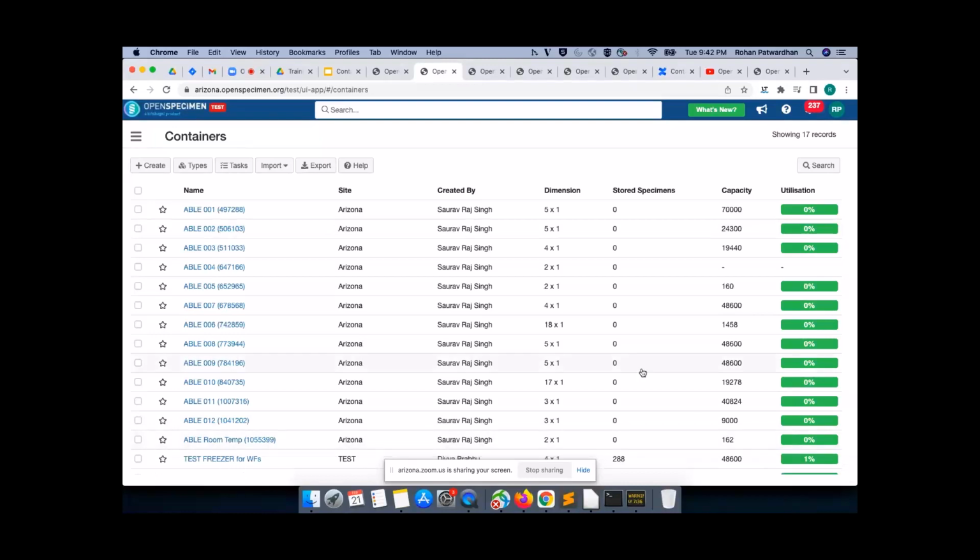Well, being able to reorder and collapse and compress things looks like it's going to be much more available to us here in OpenSpecimen. That feature will be nice. I think we can adapt the functionality that we've seen into a way that's useful for us. As we're scheduling periodic freezer defrost and things like that, we'll be able to move the entire shelf en masse to backup units. That will be helpful.